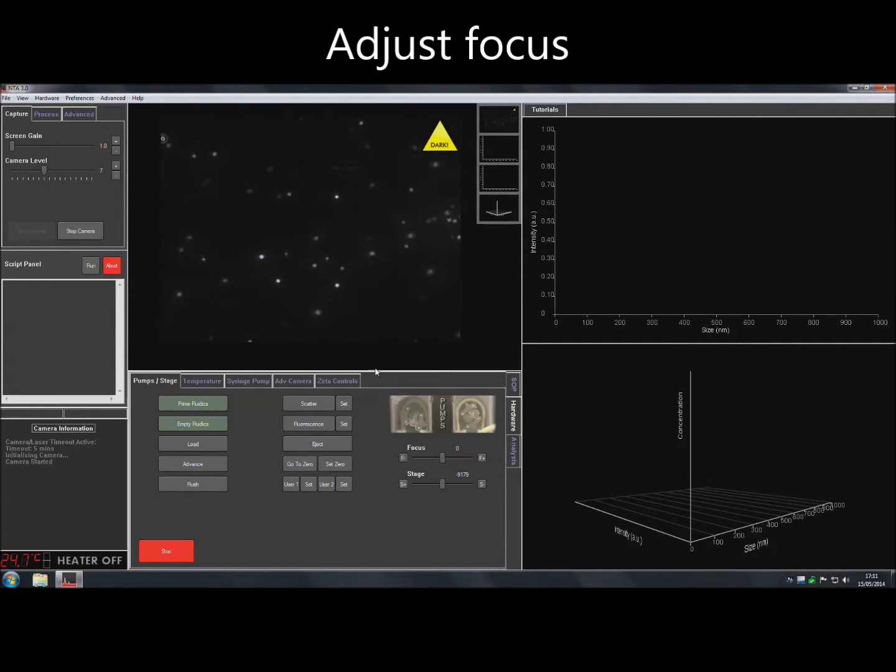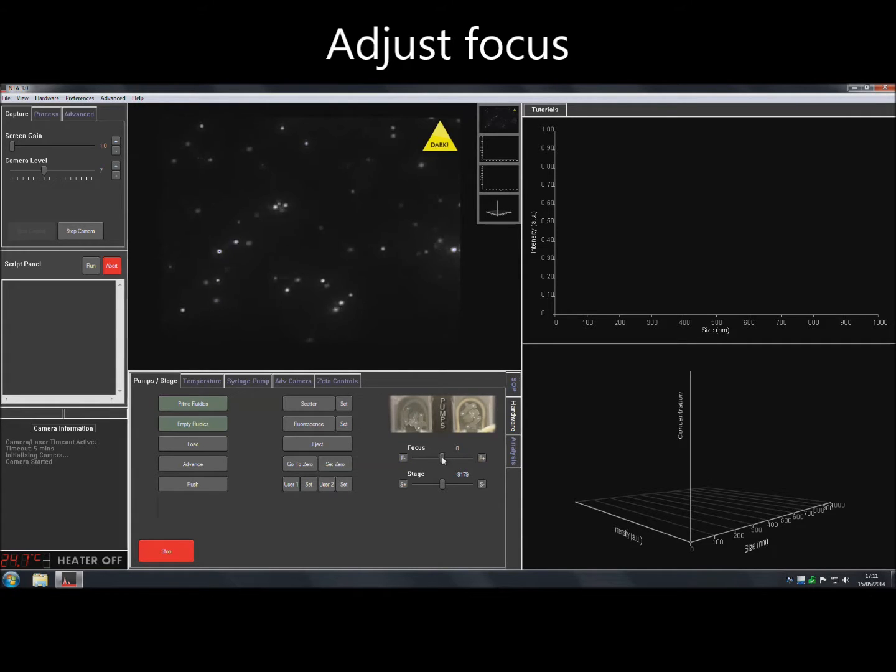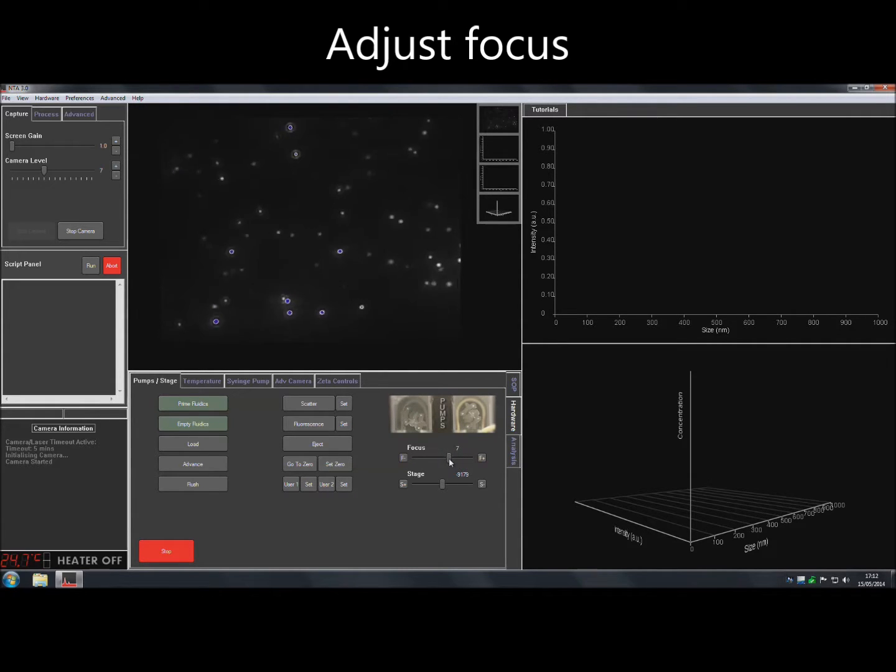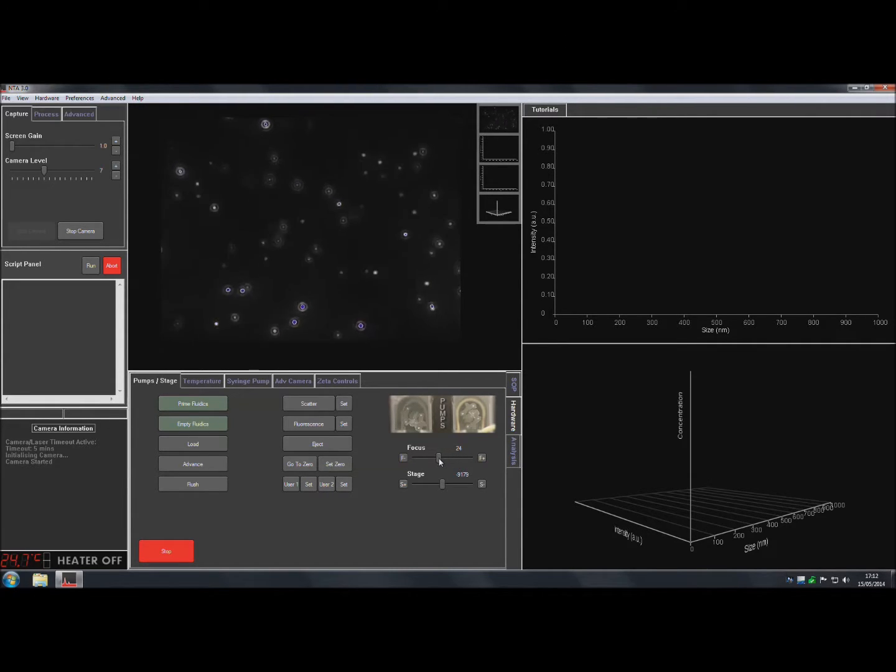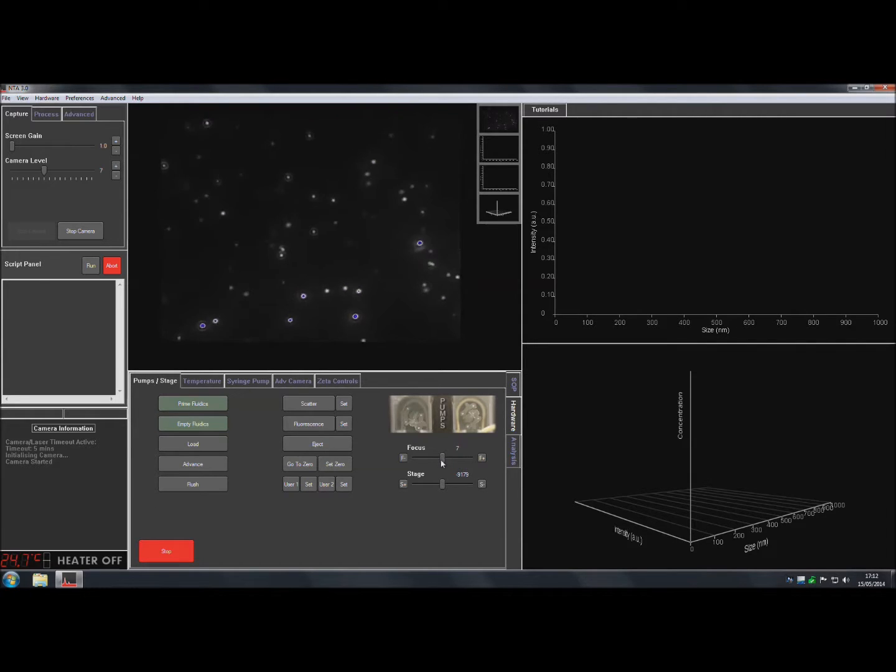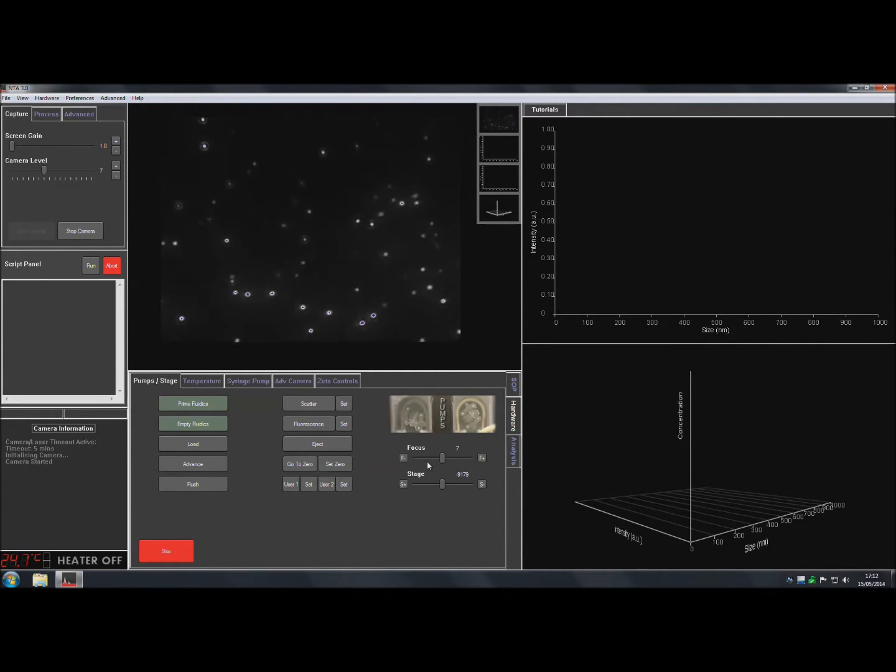Adjust the focus from within the Hardware tab at the bottom of the screen. Use the plus or minus buttons and the mouse wheel for a fine focus adjustment or the slider bar can be used for a coarse focus adjustment.